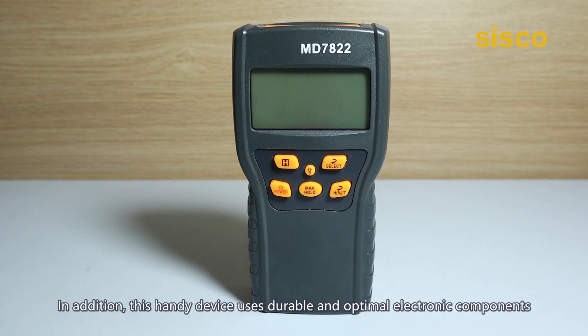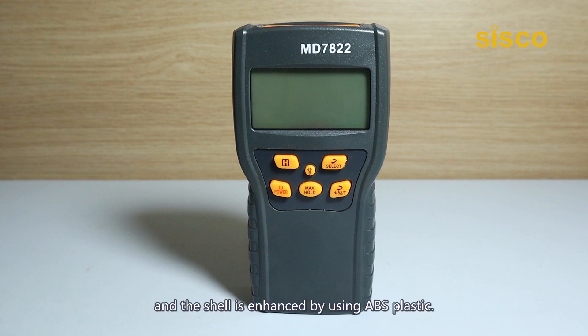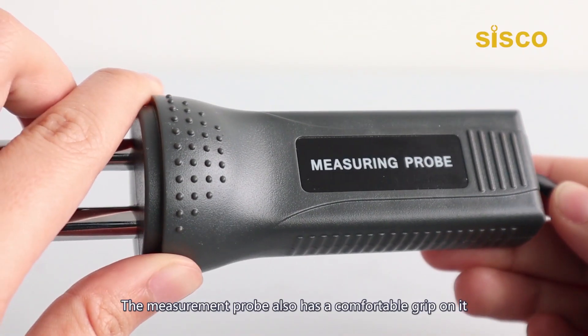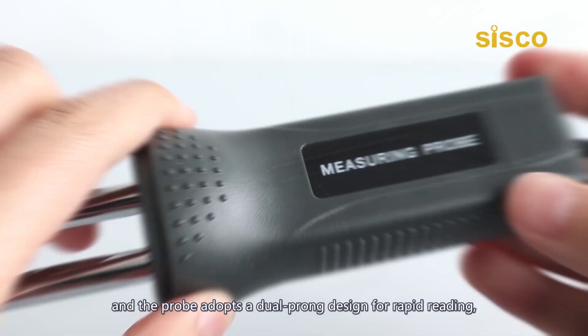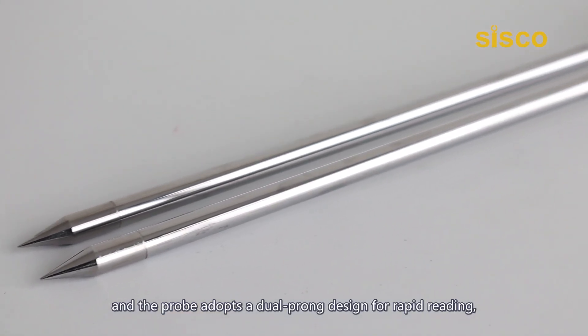In addition, this handy device uses durable and optimal electronic components and the shell is enhanced by using ABS plastic. The measurement probe also has a comfortable grip on it for more convenient measurement.